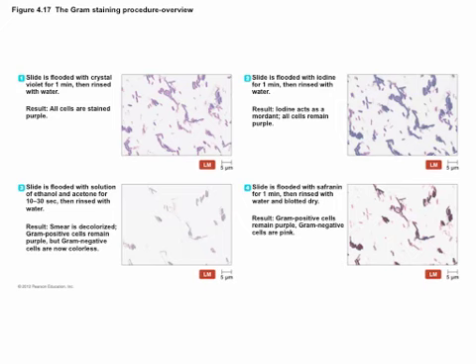And you're going to get rid of the dye in the first couple layers here, and in the first couple layers here. The problem is that you've gotten rid of only the first couple of layers here. In this, it only had a couple of layers. So here, the wall is small enough that all of the dye can move out. Here, the wall is so thick, like these ones, maybe they moved a little bit up to here, but they didn't have enough time to actually get out of the entire cell wall. So this has still got the blue coloring, this doesn't.